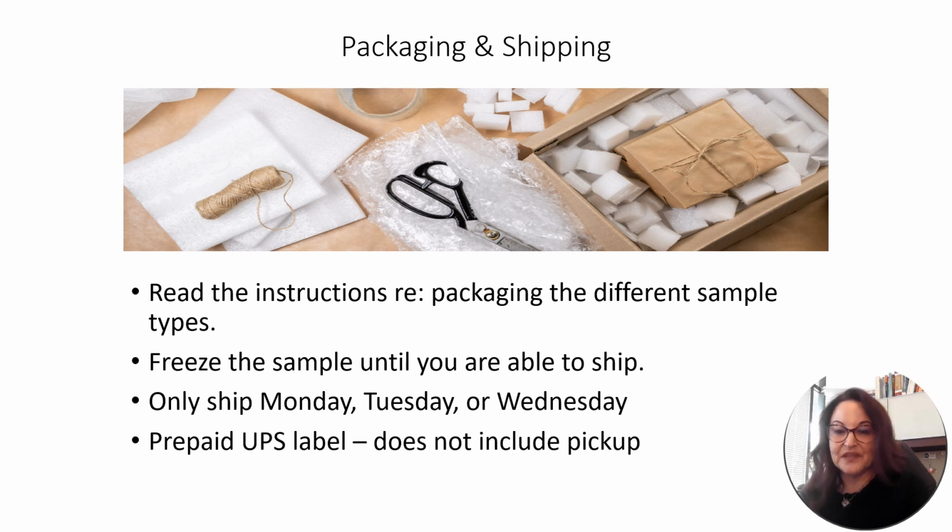Packaging and shipping. Read the packaging instructions carefully. If you are unable to ship the sample immediately, then freeze until you are able to package and ship via UPS. Please only return your samples to the laboratory on Monday, Tuesday, or Wednesday because we don't want the samples sitting at UPS over the weekend. The prepaid UPS label included with each kit does not include scheduled pickups. You can give the package sample to your usual carrier or find a UPS drop-off location that is convenient.